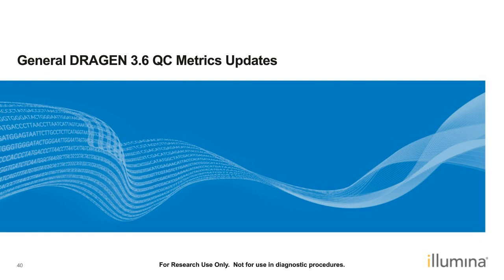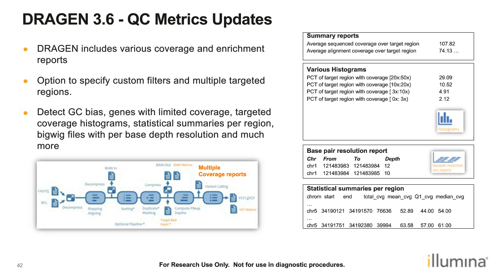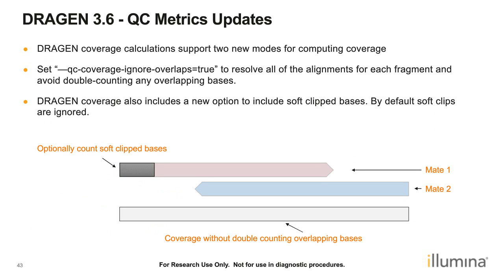Again, some of these are just general QC updates. I'll talk about them, and you have an opportunity to look at these slides. But the two major updates that we did as part of DRAGEN 3.6 come from feedback from one of our larger customers.